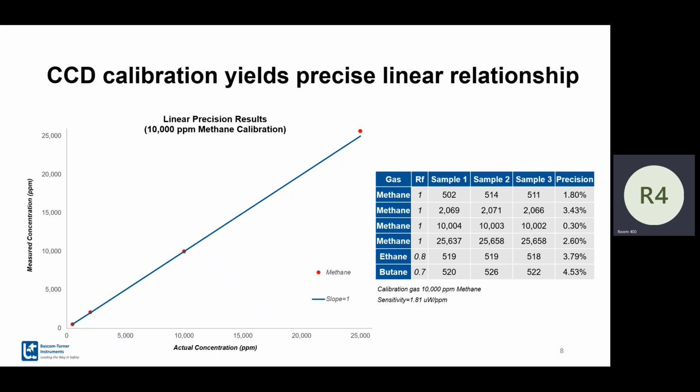So this is just to show, now, I just made it visually look nice where I showed you where the precision lines are to show that all the measurements are within it. And it looks odd because I'm really going a huge scale and I'm showing you linearly. So it looks as if the precision is very low there because it's linear. I'm trying to put 0 to 25,000 in a linear scale. So things look odd. But in reality, if I zoom in, all measurements would look like this if things were scaled into the precision, because they're all well within the precision.